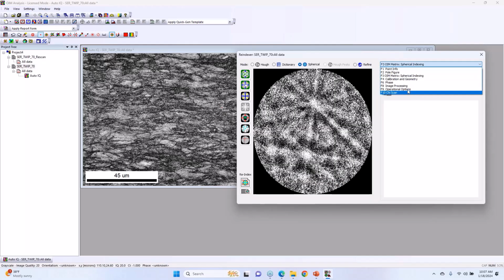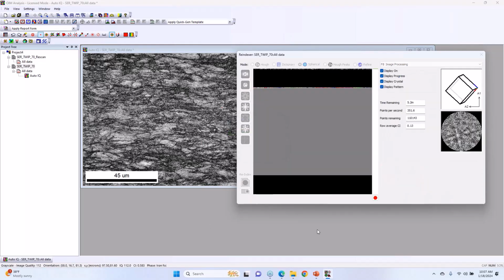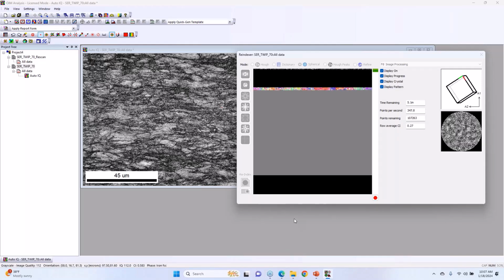So I'm going to go through and say I want to do one with NPAR on. We'll let that run for a minute. So while that's running, any questions? Yes, please.